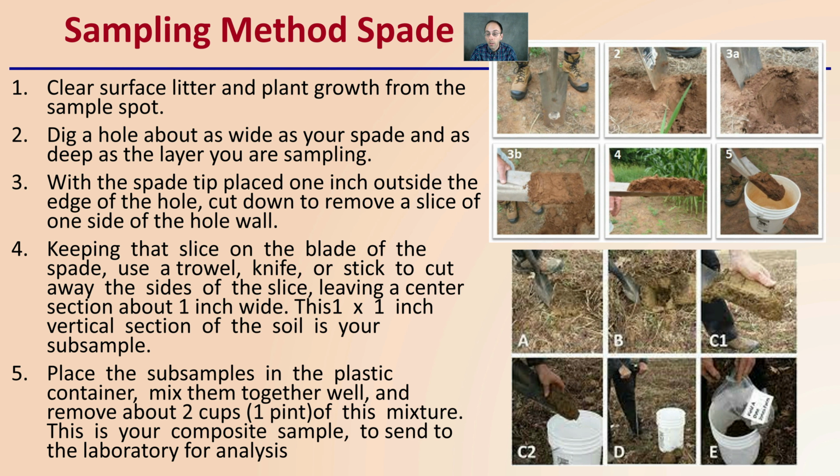So in this area here, what we want to do is make a hole. So we get our spade and remove a chunk of soil. Now we don't want to take this as our soil sample. What I'm doing is cutting a hole down here. Got some earthworms, always nice to see. And I'm going down that same about 6 to 9 inches. With my spade, why I want a spade with that flat point here, is I'm going to go through now and not take this soil as my sample.